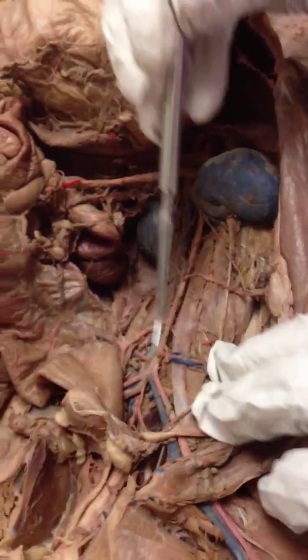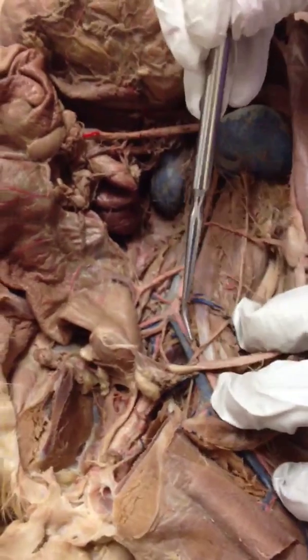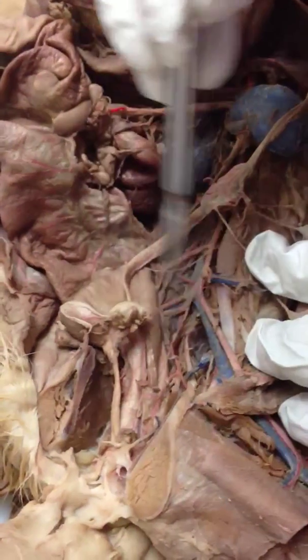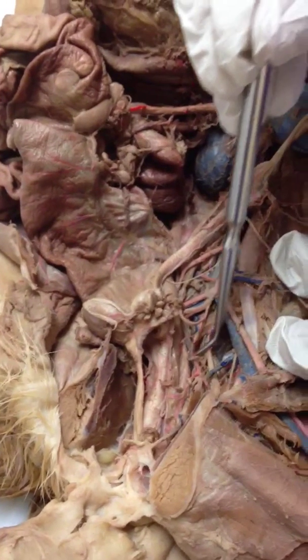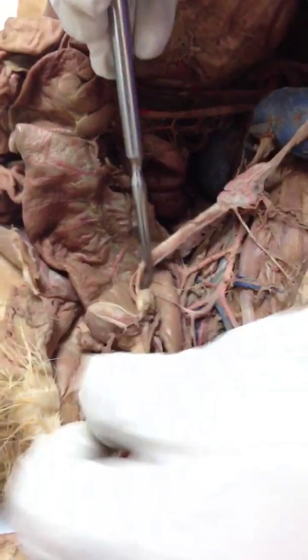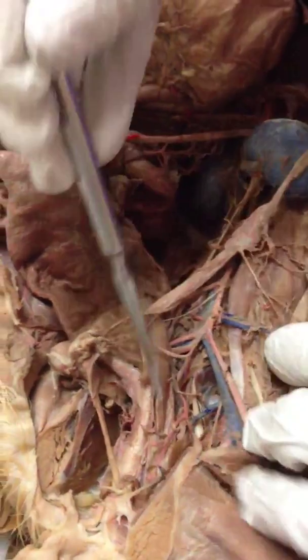And then from here, the aorta branches into the external iliac artery, which is here, and then the internal iliac artery, which is this one right here. I can grab it. We have the first branch being the umbilical artery.